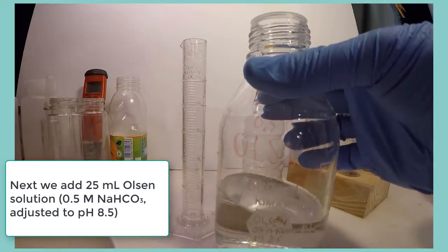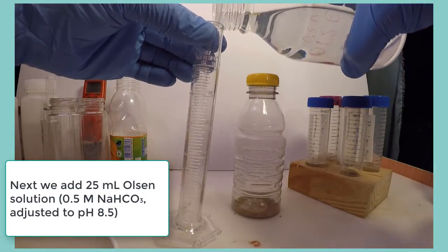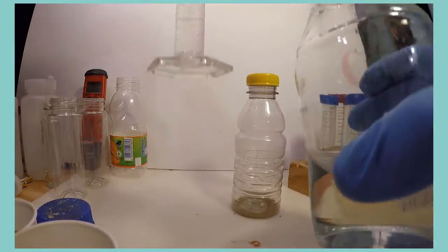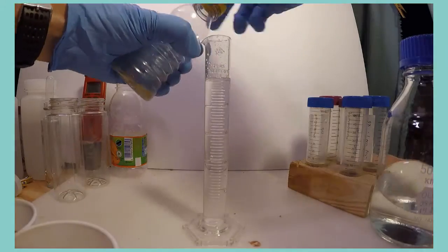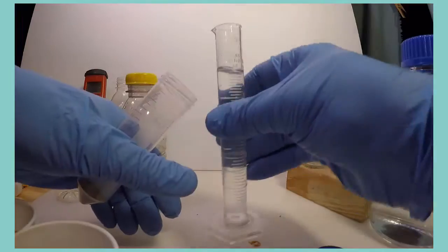Now we add 25 milliliters of Olsen solution, which is half-molar sodium bicarbonate adjusted to a pH of 8.5. We add this amount to each tube or bottle with the soil sample inside. After adding the Olsen solution, each bottle should be shaken for 20 minutes.